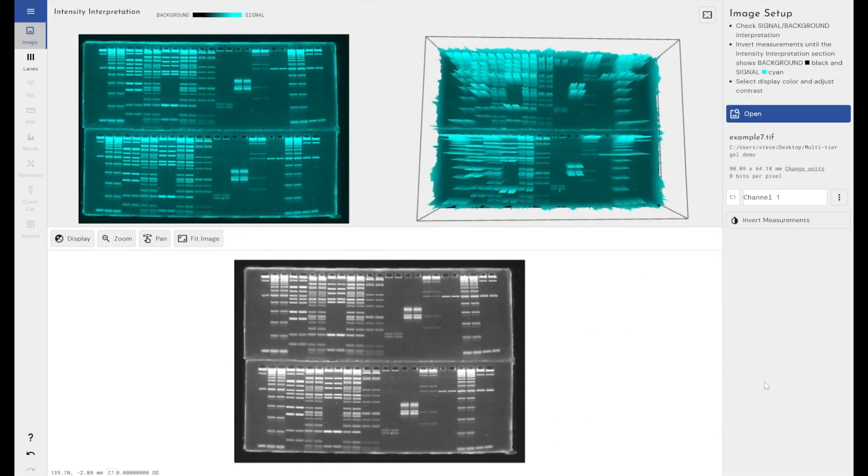Hello everyone, so today I'm going to be showing you through the new annotation features that we've built into the latest update to Alpharetix 1D gel and blot quantification software. This is version 1.1 and it allows you to add annotations in both the image and on the data within your lanes, and I'll be guiding you through that in a second.